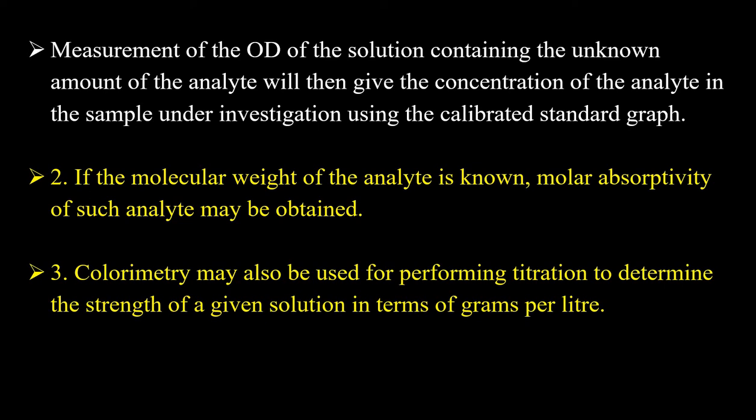Second application, if the molecular weight of analyte is known, molar absorptivity of such analyte may be obtained. Third application, colorimetry may also be used for performing titration to determine the strength of the given solution in terms of grams per liter.